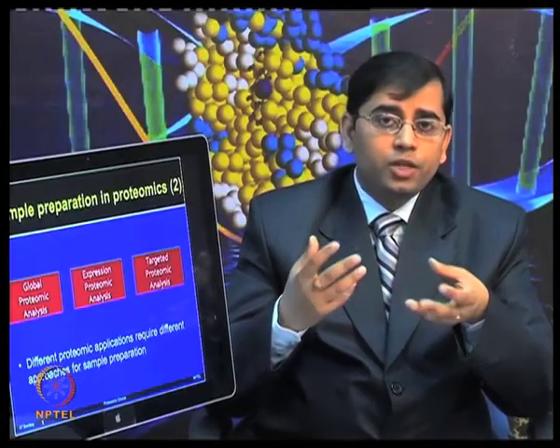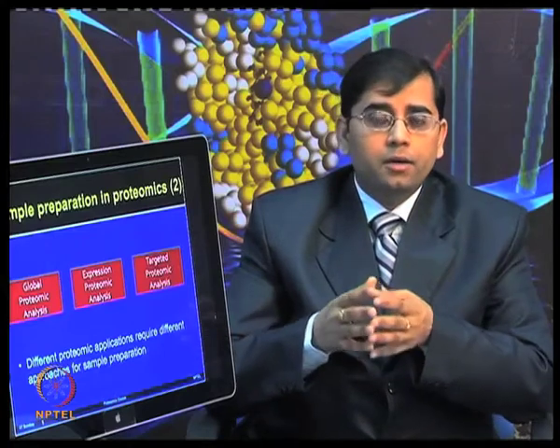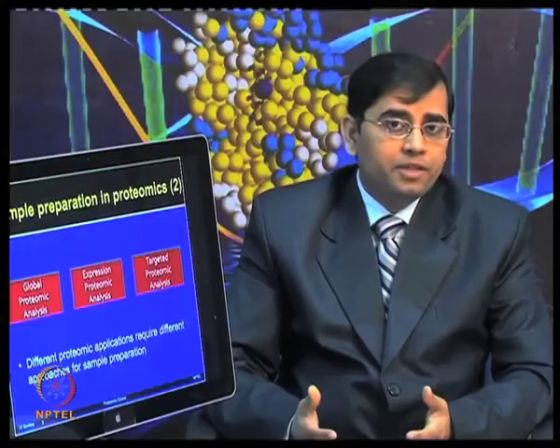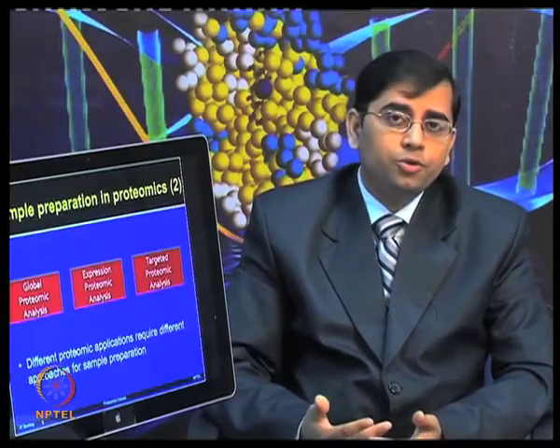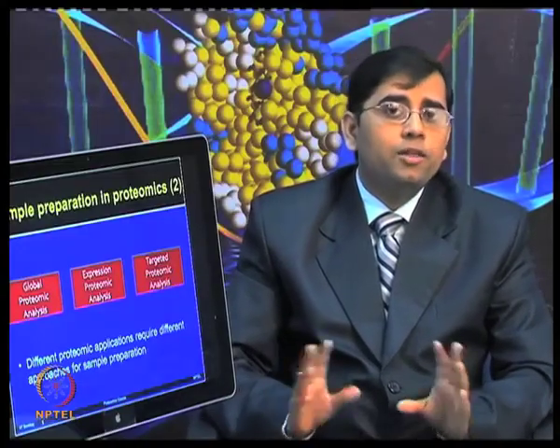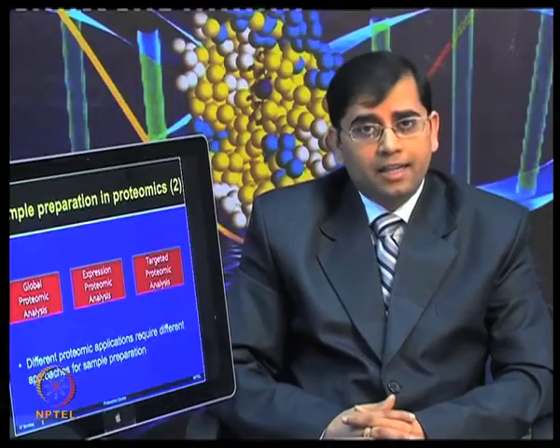So, one needs to try different types of strategies when thinking about performing a sample preparation. What is your objective? Whether you want to do global profiling or you want to do expression profiling, in either case you need to extract all the proteins present in that particular target sample.